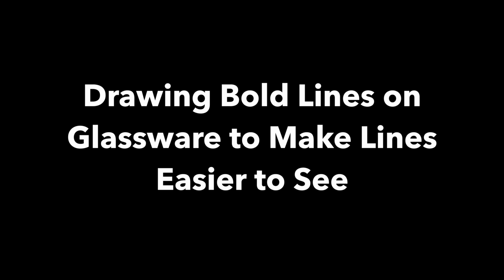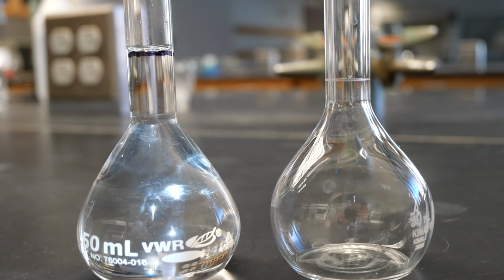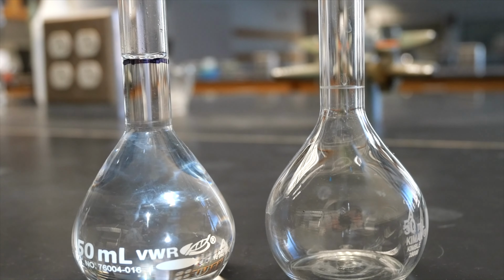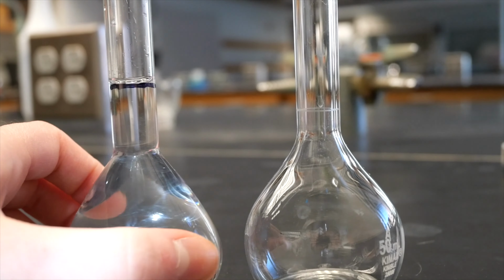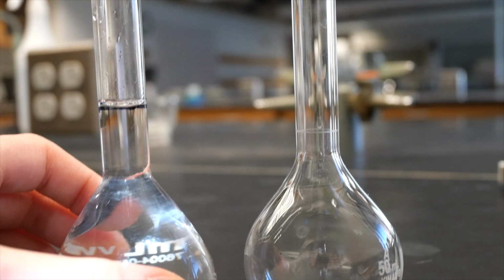Drawing bold lines on glassware to make lines easier to see. I have a 50 ml volumetric flask with water inside. The fill line is very hard to see. It's gray or white. But if you take a permanent marker and draw on the line, it's easier to see.